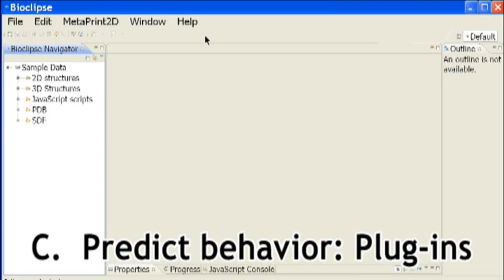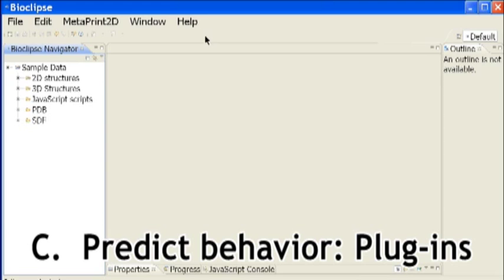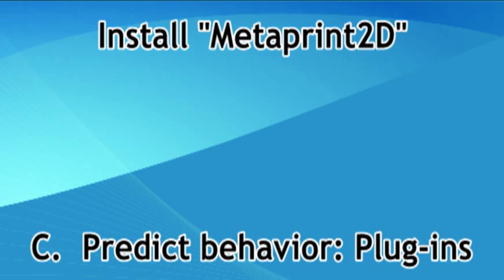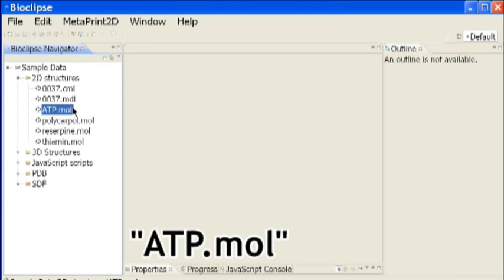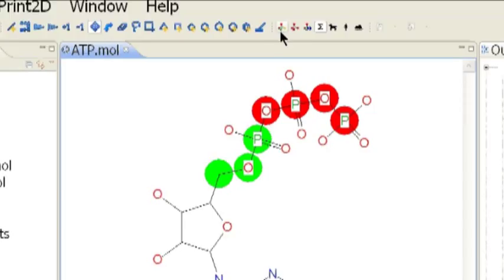From the help software updates feature, after installing Metaprint2D, you can predict metabolic sites. Open ATP.mol and in the upper toolbar click the execute Metaprint2D icon. The highlighted atoms indicate that the terminal phosphate bonds are the most likely to be metabolized.